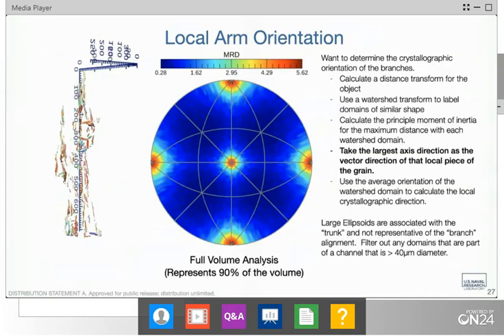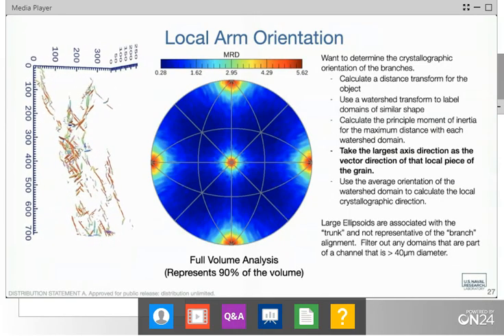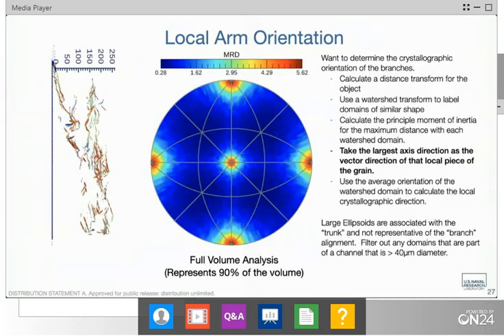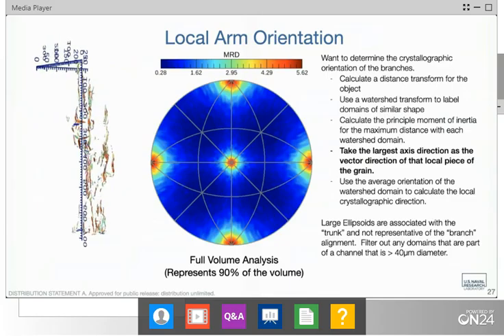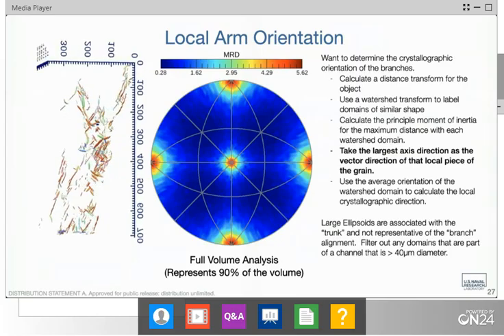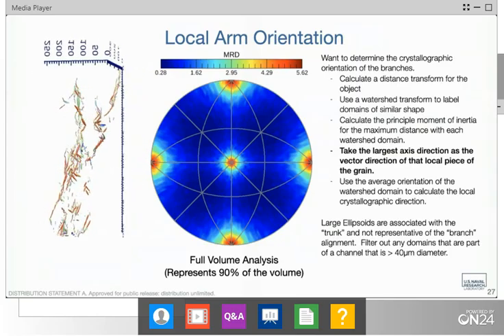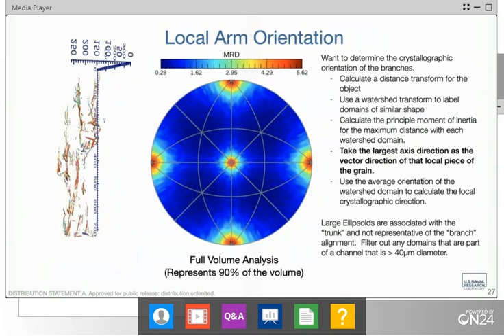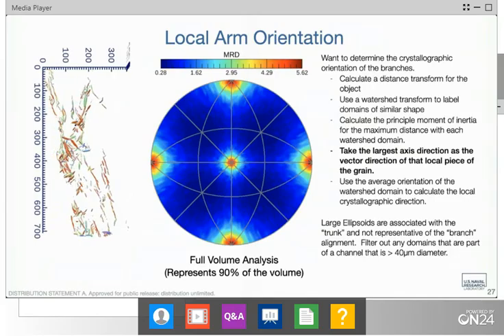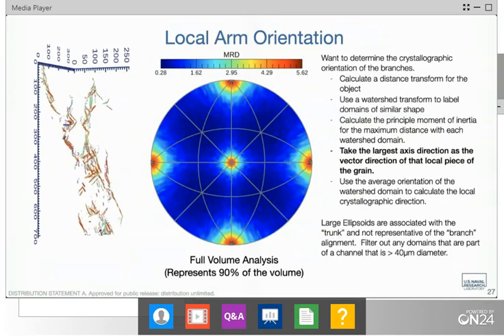I think one of the things that is unique is that we are running this for days and days on end, which is admittedly a very difficult set of troubleshooting to do if you do have problems. But we found it to be reasonably stable. One of the things that we had when we were designing this whole thing was a philosophy of if the system ever feels confused, please come get a human. And so that's very much built into how everything works.